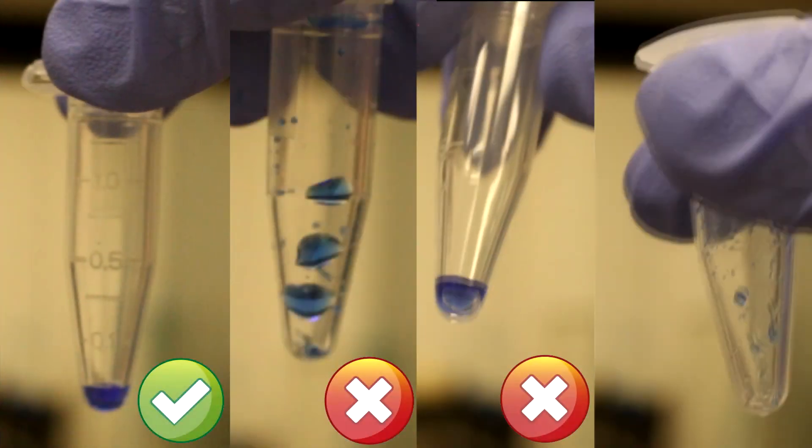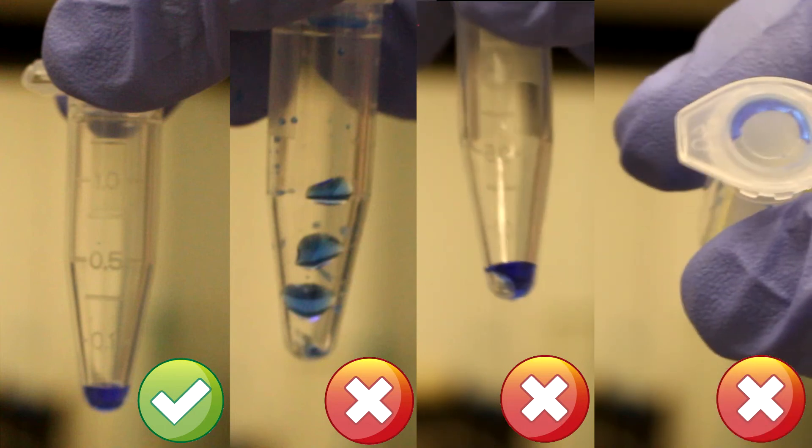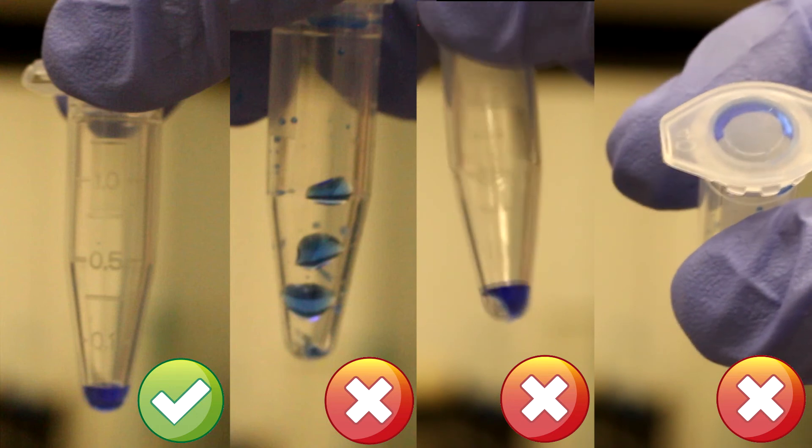Shown here is a well-contained sample compared to samples incorrectly mixed. This may happen if the samples are not pipetted to the bottom, air bubbles are introduced, or if the vial is overturned.